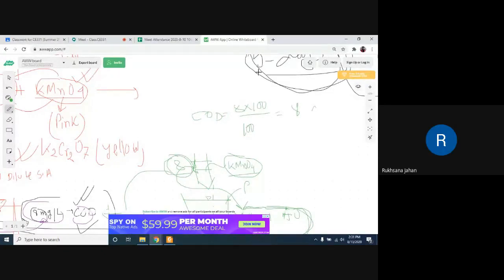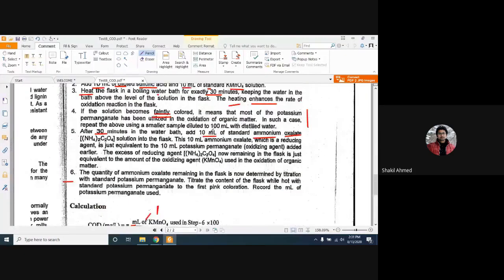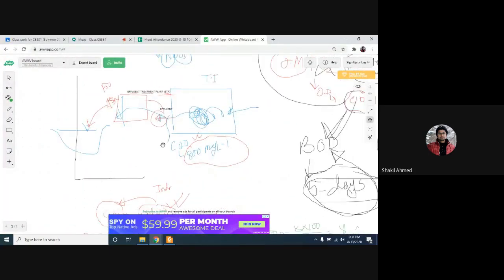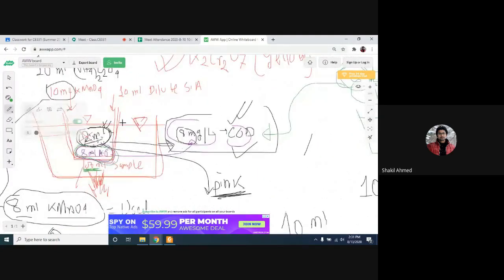Yes, ma'am. Fine. Now we skipped a topic here. Remember? What did they mean here? For example, you had higher COD, more polluted water, for example 25 or 15 milligram per liter COD instead of 8.